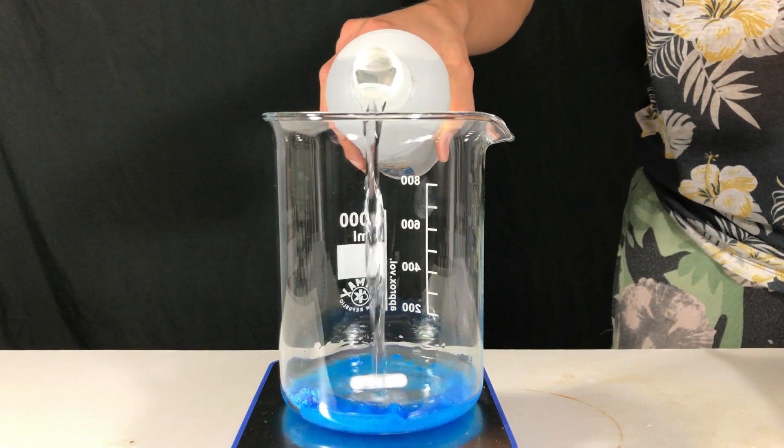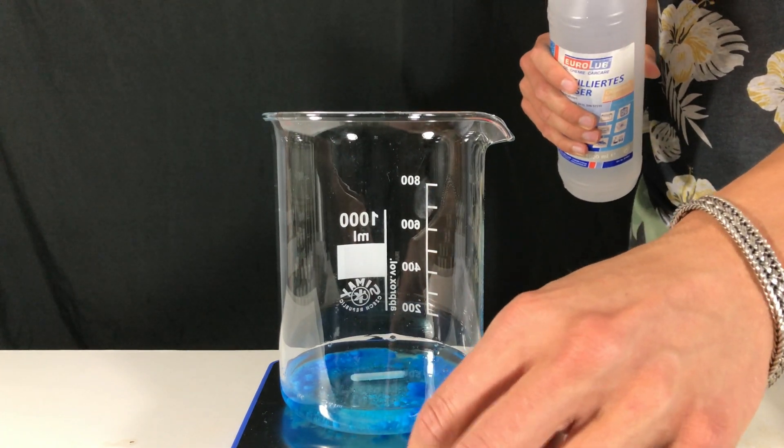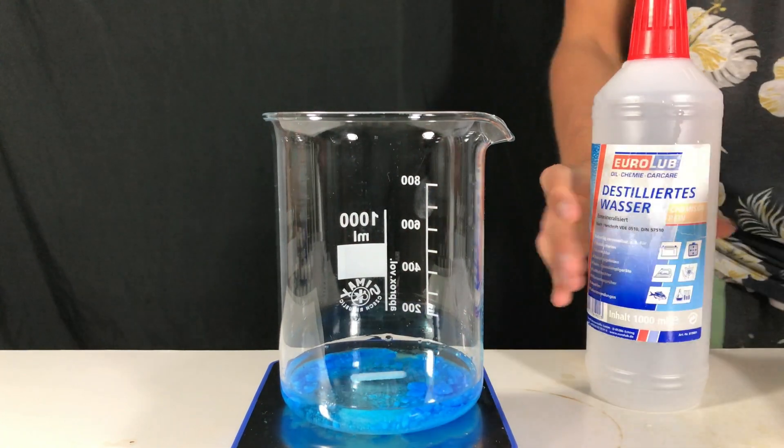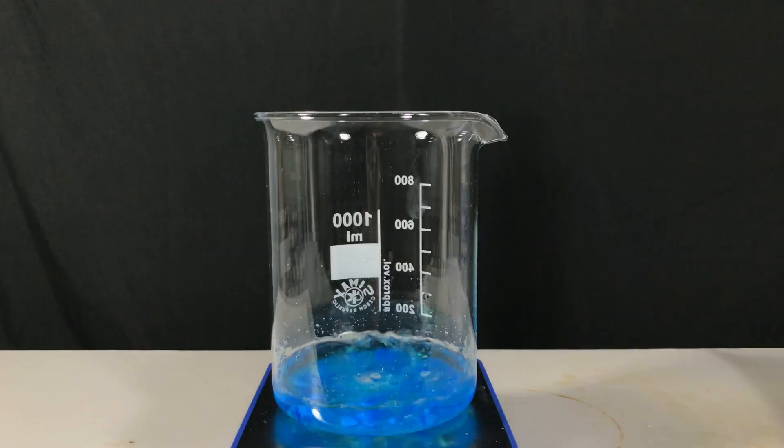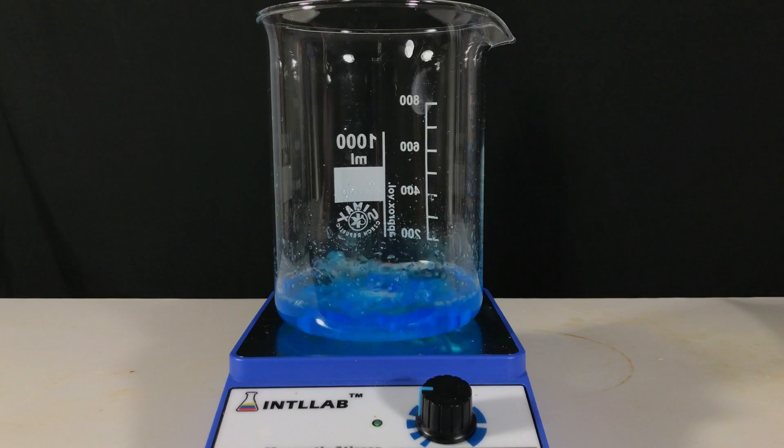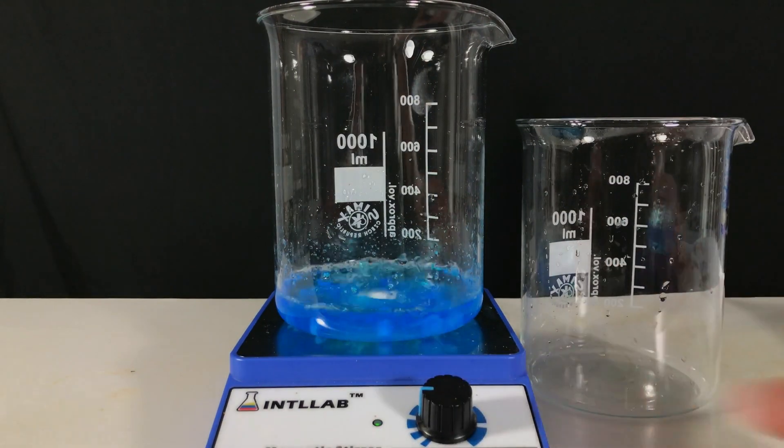Enough distilled water to dissolve all of the copper sulfate has to be added. While the copper sulfate is still dissolving we take a second beaker.